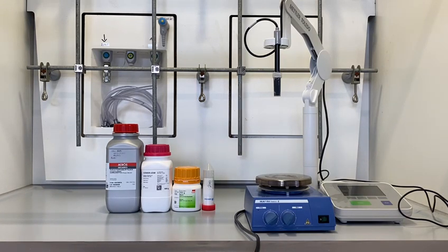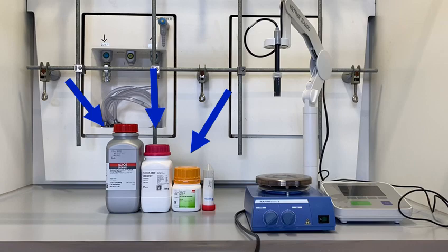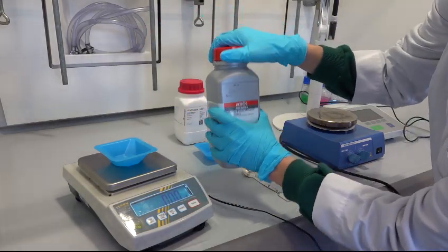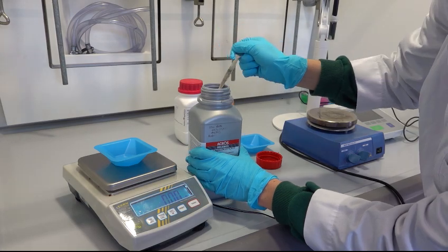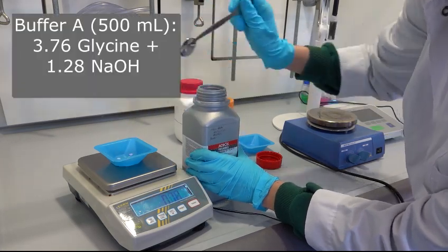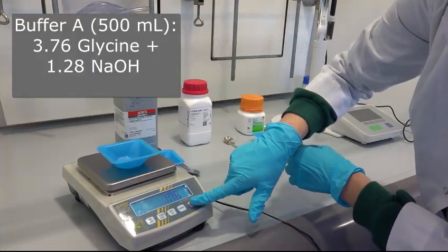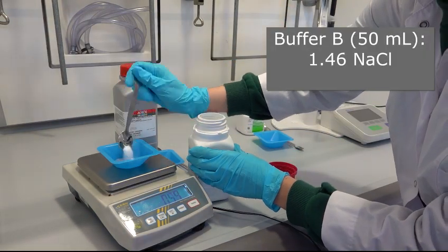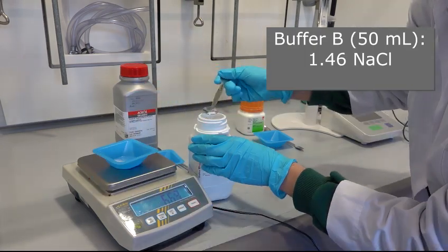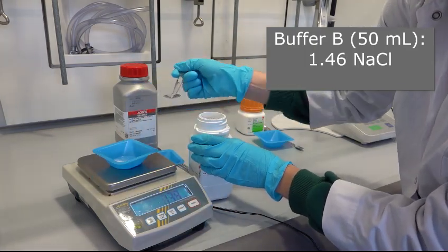For the buffer preparation, we will need sodium hydroxide, glycine, and sodium chloride. For a total preparation of 500 ml of buffer A, we are going to weigh 1.28 g of sodium hydroxide and 3.76 g of glycine. 1.46 g of sodium chloride will be used for addition to buffer B later on.